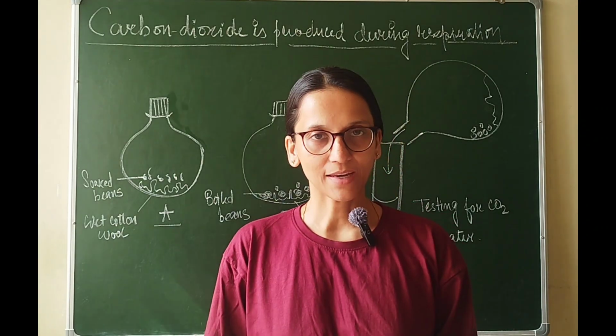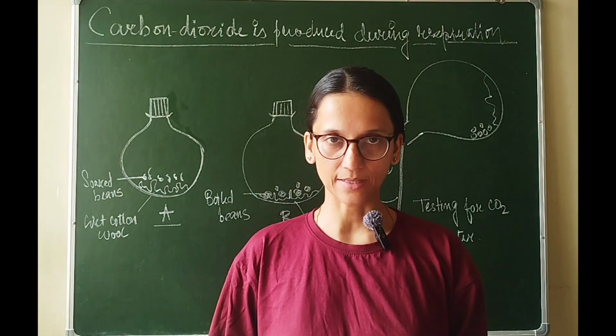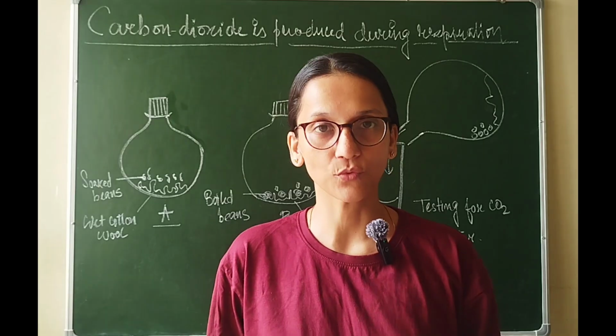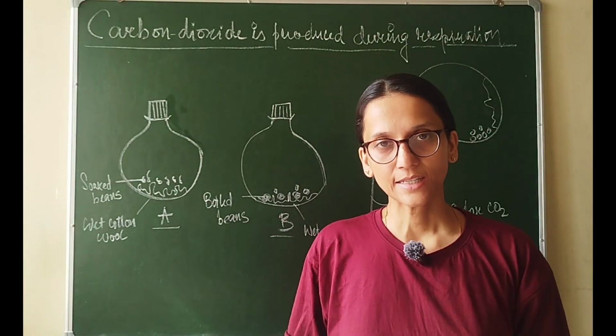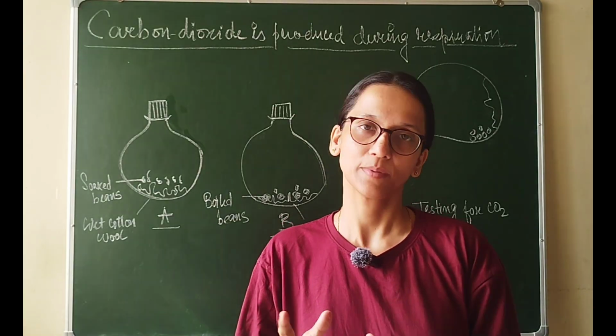Well, this video of mine is in continuation to my lectures on the chapter Respiration in Plants. In the last video we have already understood how experimentally we can prove that at the time of germination seeds require oxygen. Now in today's lecture we will prove that carbon dioxide gas is liberated by germinating seeds.